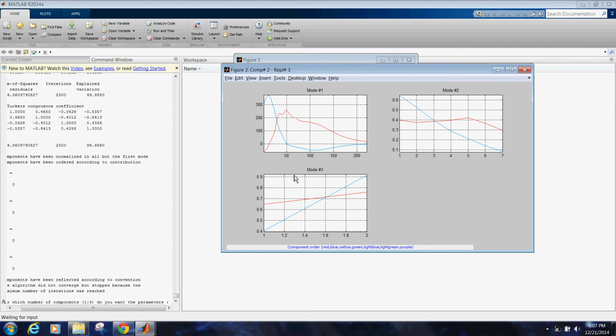If you remember the dimensionality of the data we used for this, it was 221 by 7. In this case, it was by 2. This one was a data block from 2 different individual data sets. So this is where the position comes into play. We know that we selected position 1 for a particular data set and position 2 for a different particular data set. We can look at the PARAFAC GUI to get that information.